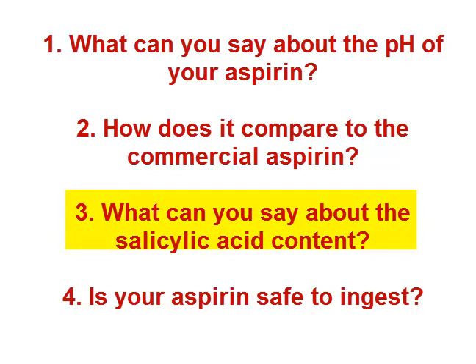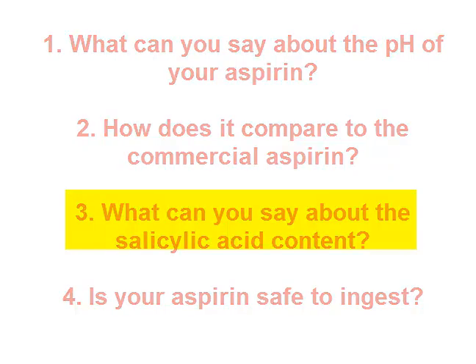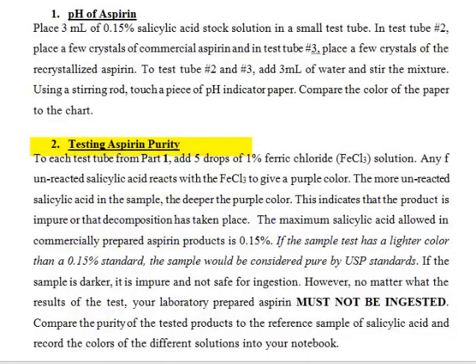In the second part of the experiment, we're going to test aspirin purity using what's called an iron chloride test. Normally, if you add iron chloride, any unreacted salicylic acid will react with it and that solution should turn purple. So we're going to test to see if there's any unreacted salicylic acid by adding a few drops of iron chloride to our aspirin sample.